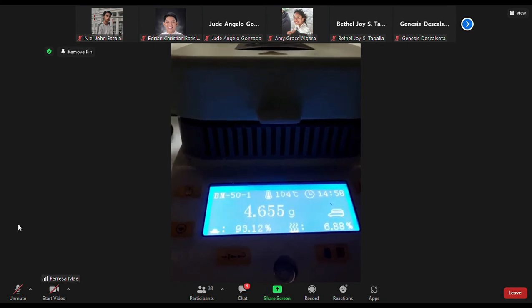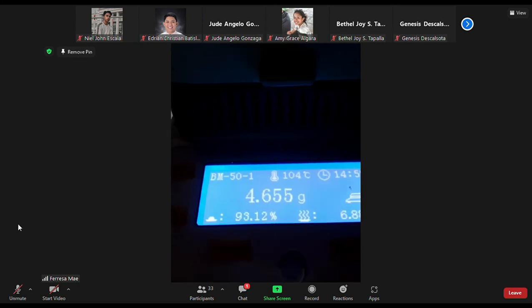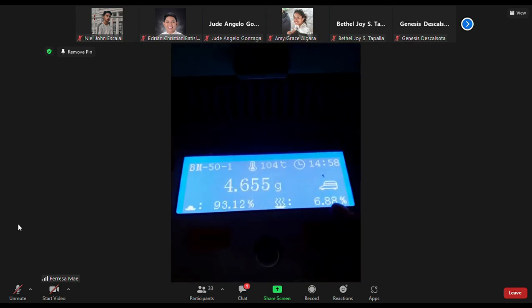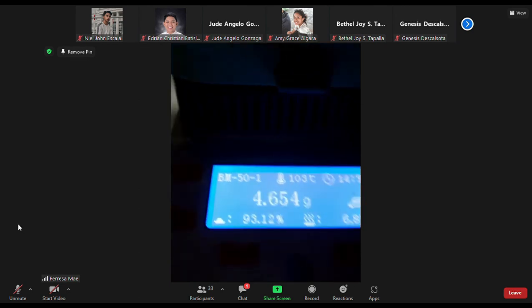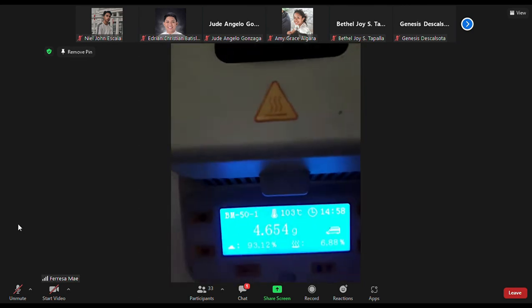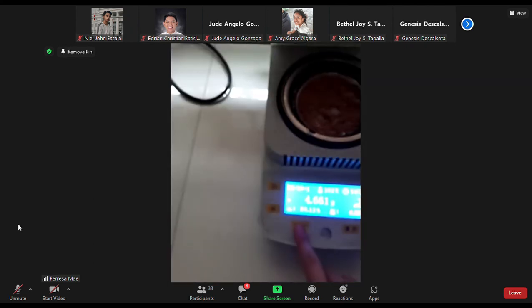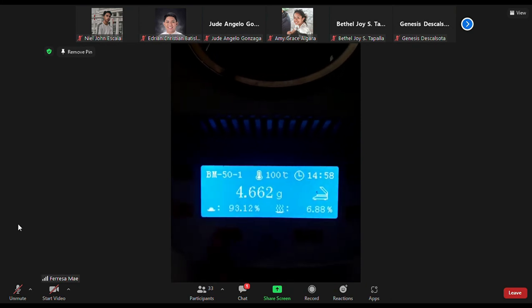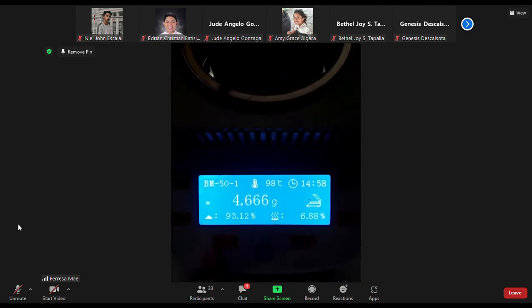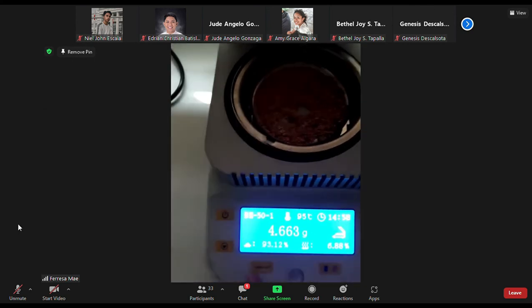Ano siya, class? Nag-beep na siya. Ang moisture niya is 6.88%. So, class, may questions pa, class?